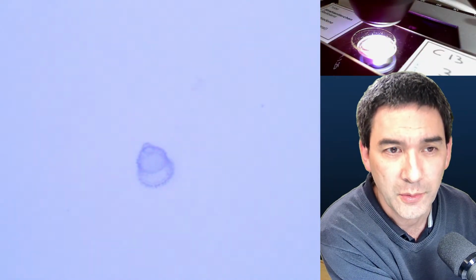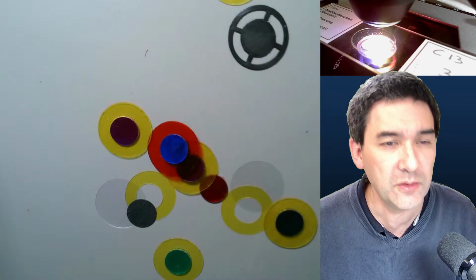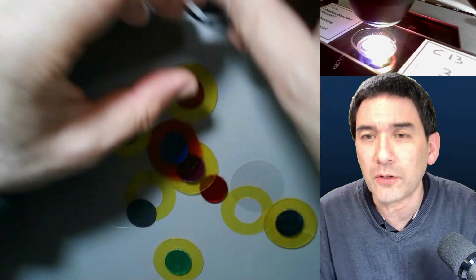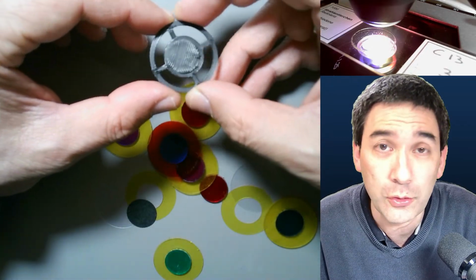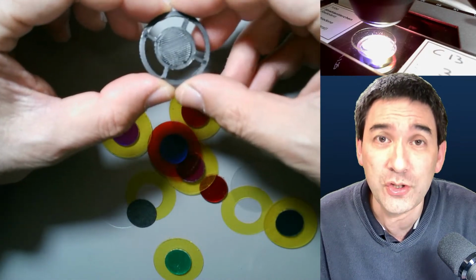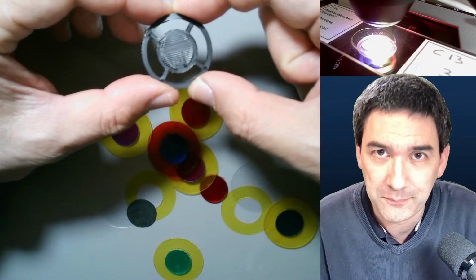This is not a, by the way, this is not a yellow one. You know what I'm going to do? I'm just going to go back here to the desk while I answer the question. Basically, these discs here, these homemade discs, can be put into pretty much any filter holder of a regular condenser. However, they have a disadvantage, and the disadvantage is that they take away a lot of light.